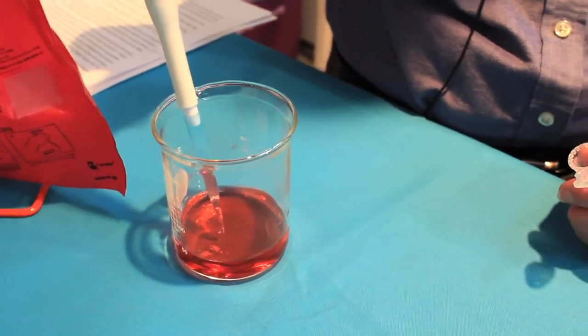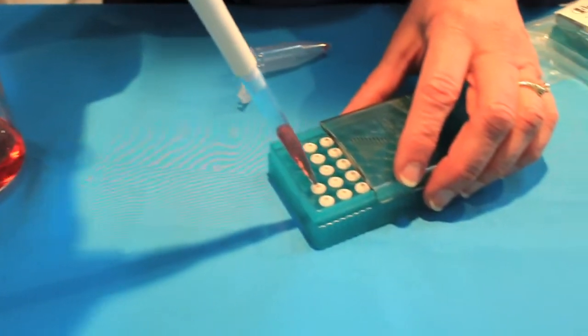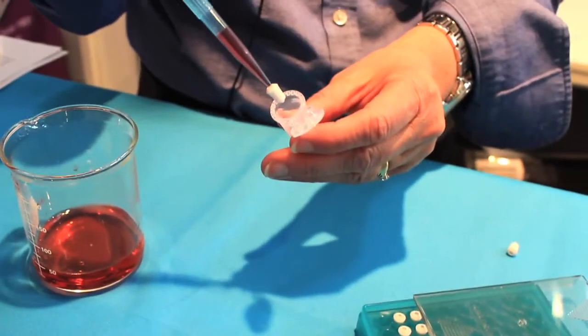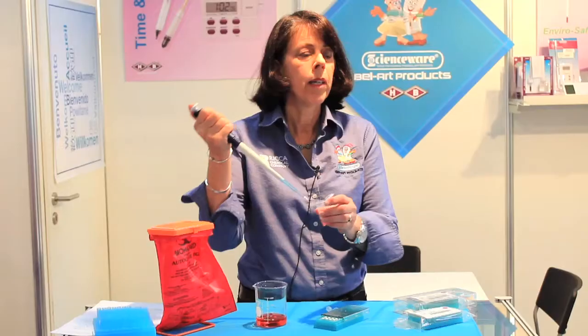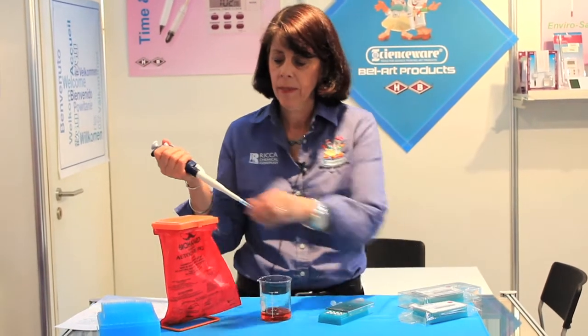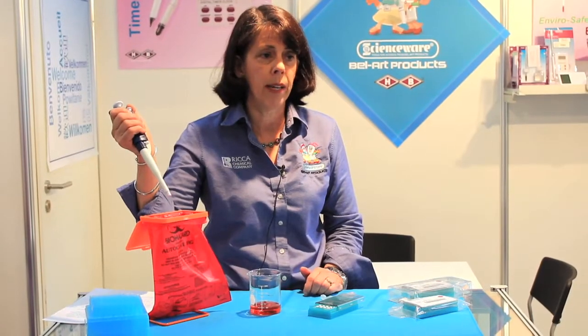After aspirating my sample into the pipette tip, I simply press FlowMe onto the end and then I dispense my sample through FlowMe into my container. Now my sample is ready for flow and fax analysis, and I simply eject my pipette tip with FlowMe into an appropriate waste receptacle.